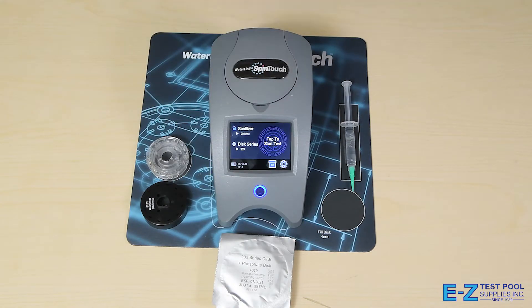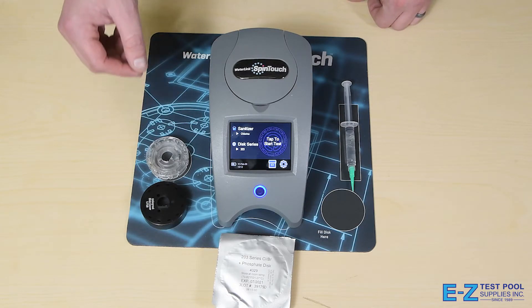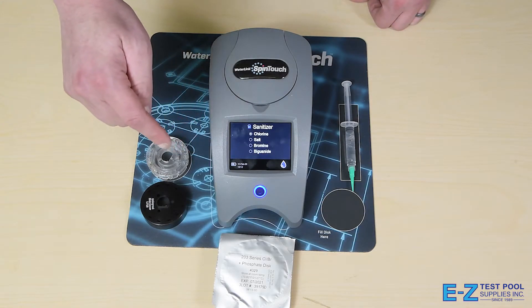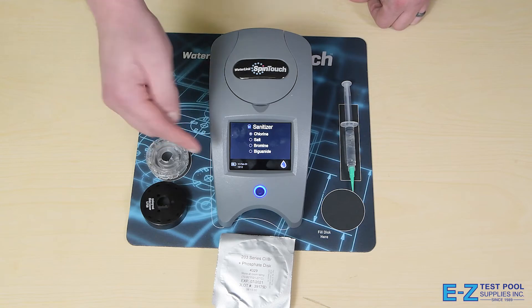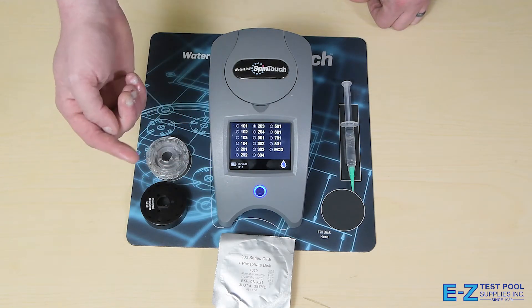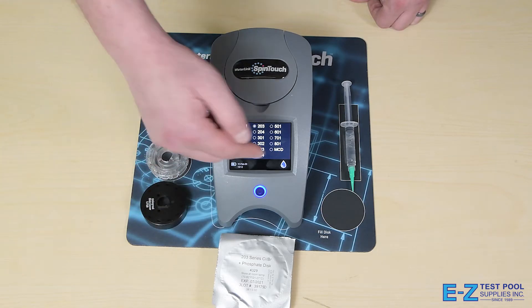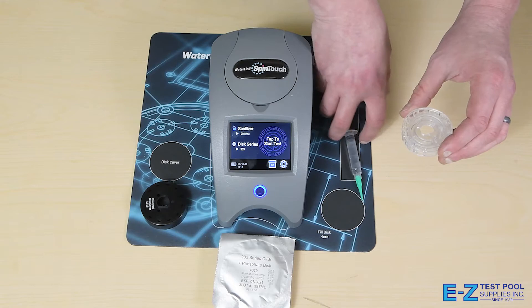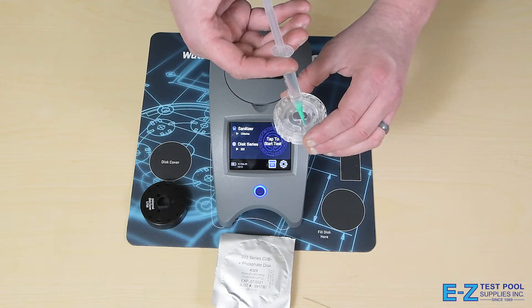As you can see, we have a very intuitive touchscreen design. We'll be using the 4329 SpinDisc and testing for 10 different parameters today. You can choose the sanitizer available — in this case we'll be using chlorine — and the disc type that you want to use, in this case the 203 disc or the 4329. You will take your SpinDisc here and fill it up through the fill hole with your pool water.